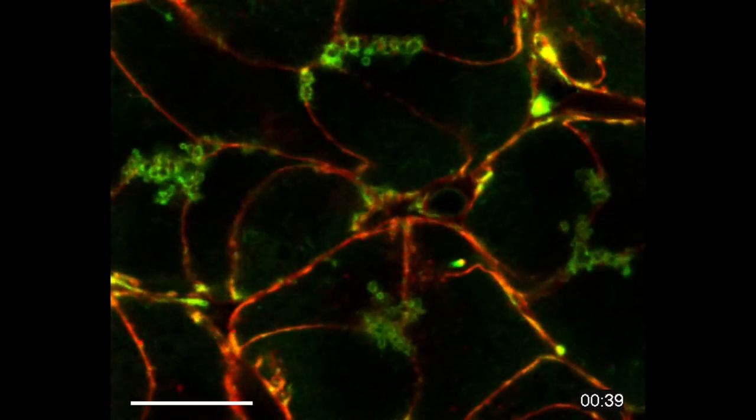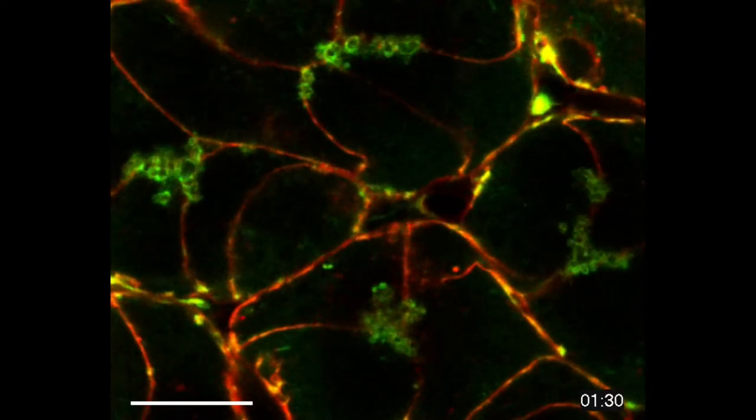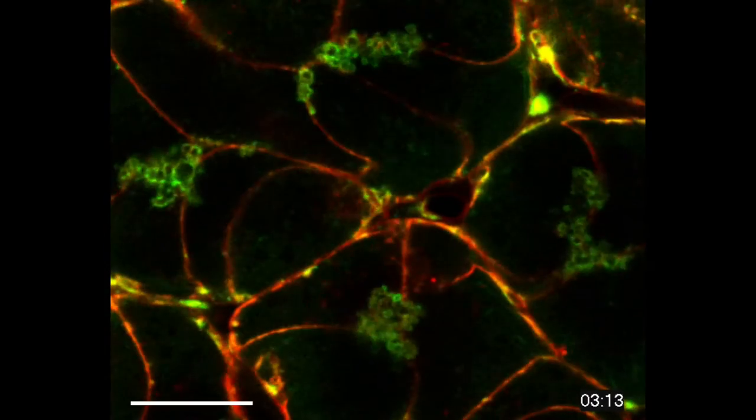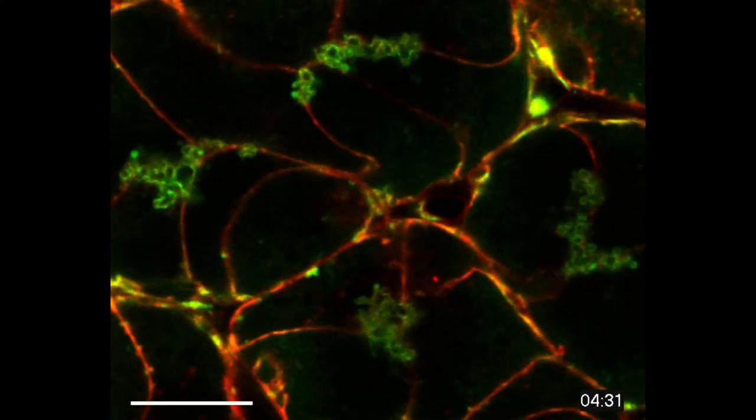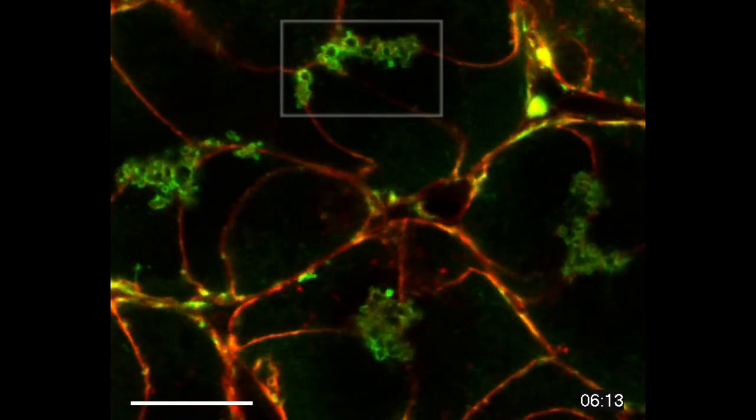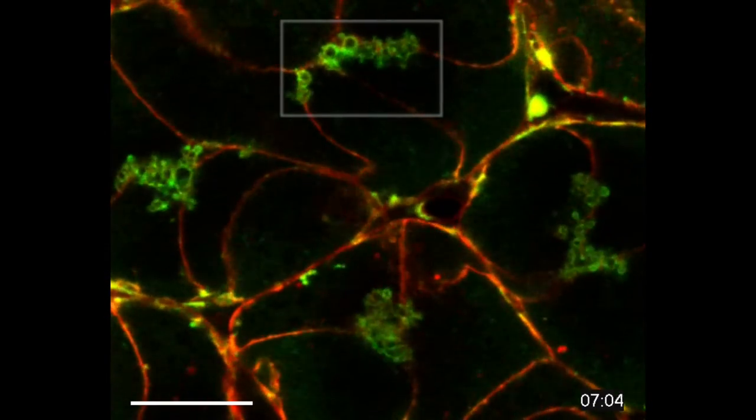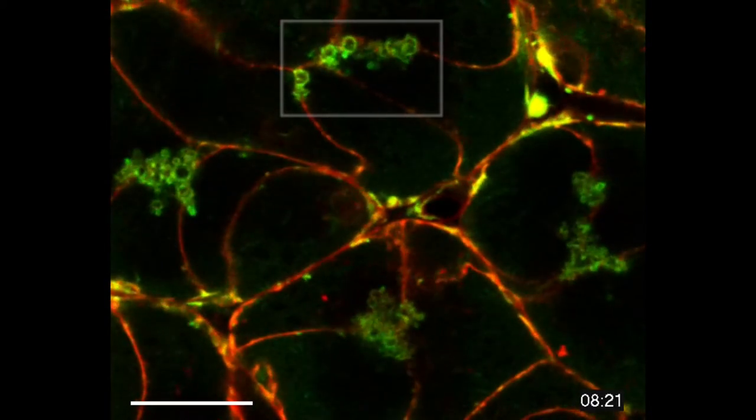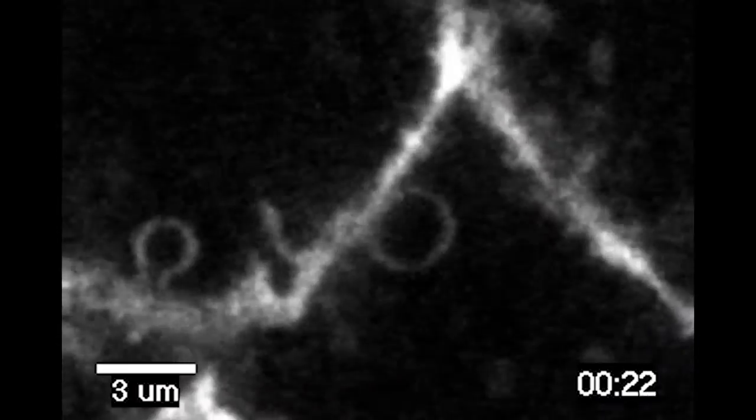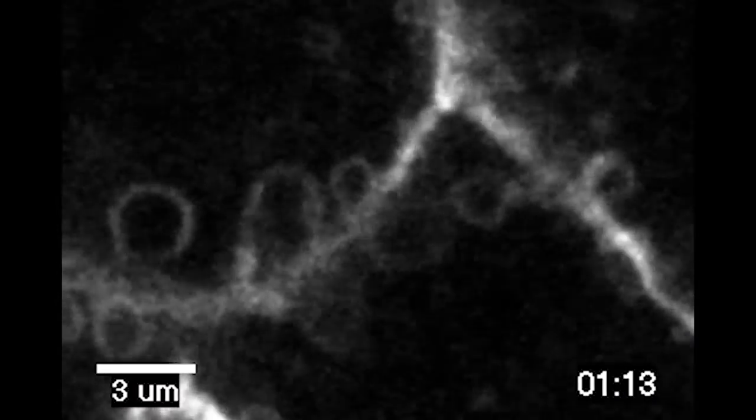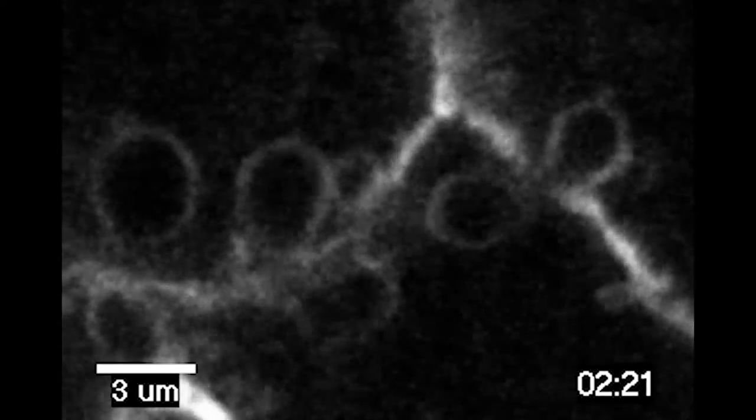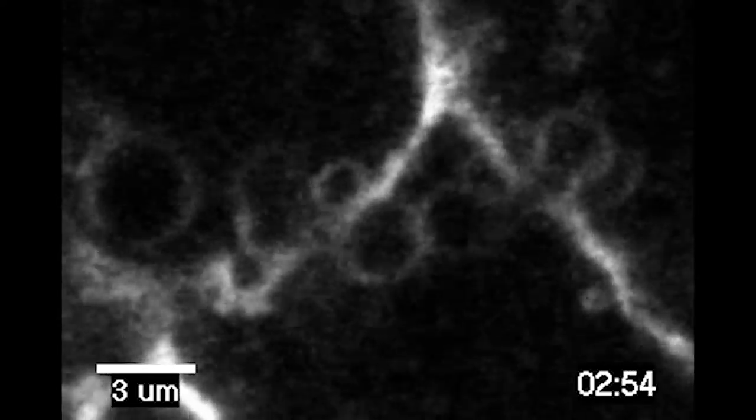In order to see the actin appearing on the vesicles, we used mice engineered to express a fluorescent marker for filamentous actin in green and a marker for the plasma membrane in red. If you focus on the inset in this movie, you can see the secretory vesicles in the pancreas that fuse with the plasma membrane and become rapidly coated with F-actin before their integration. When we take away actin using a drug that does not allow the formation of the filaments, the vesicles do not integrate into the plasma membranes. Instead, they begin to grow and get stuck at the plasma membrane.